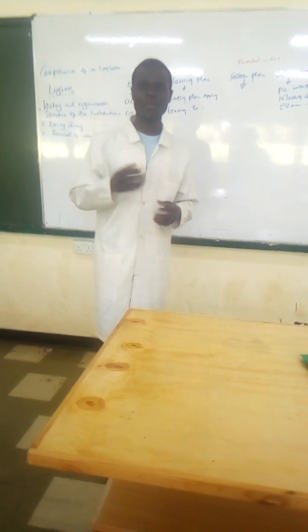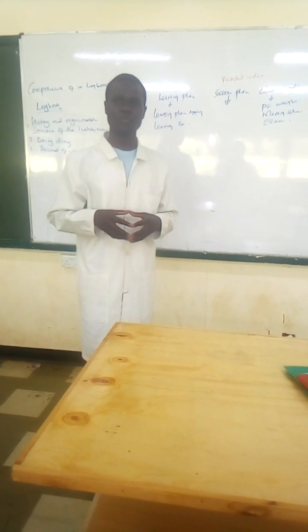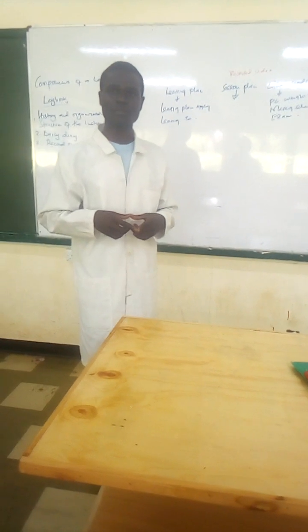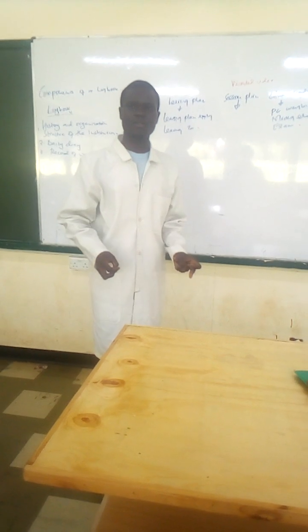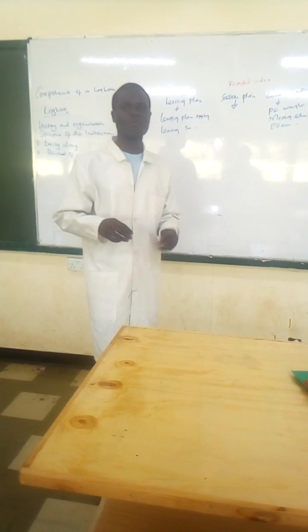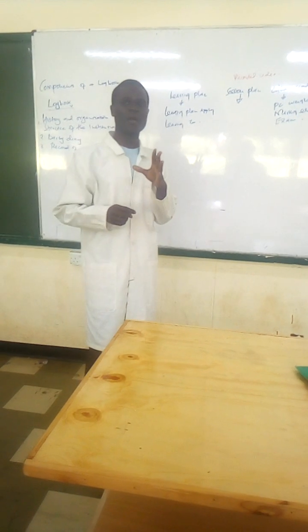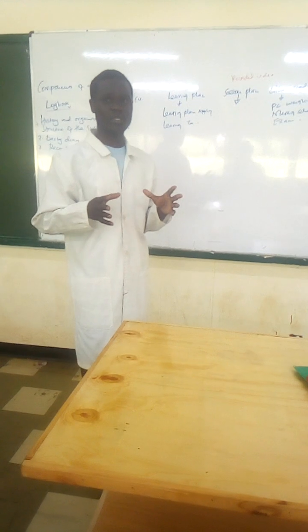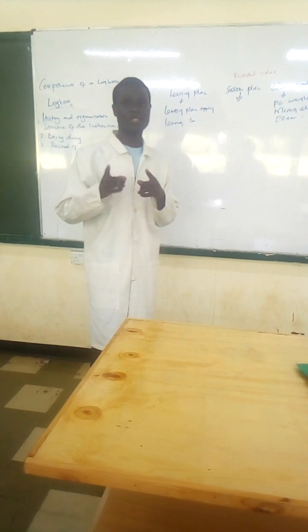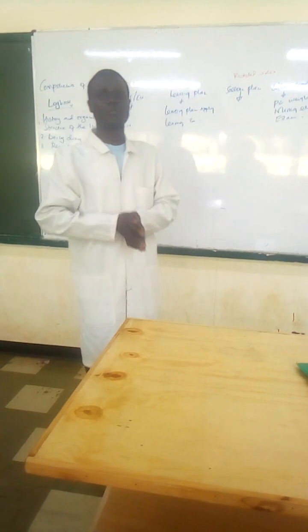Yes, my student, you have a question? Yes, I do. Kindly, teacher, I would like you to give me an example of a stain that is used in doing a simple staining. We have several stains, but I will give you crystal violet. It is a stain, that's an example of a stain. So don't confuse. Okay. Good.